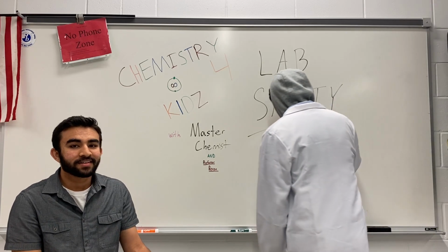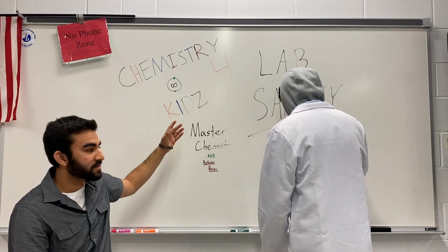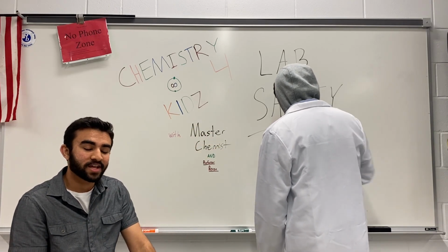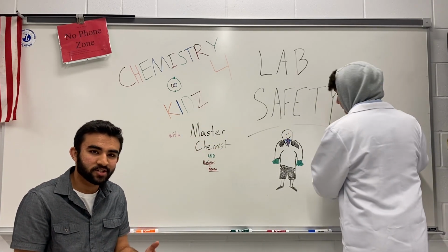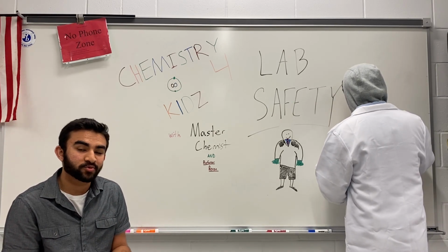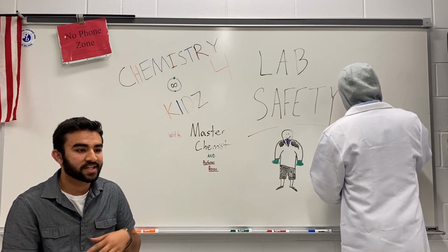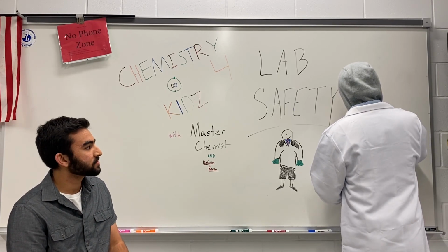Anyway, so today, guys, we're going to talk about lab safety. Chemistry for kids, everyone. Lab safety. Today we're going to take you through the ins and outs of what it means to be safe in the lab, all the rules that you're going to need to know, and the attire that you're going to need to wear, to make sure that you're safe and everyone else around you is safe.